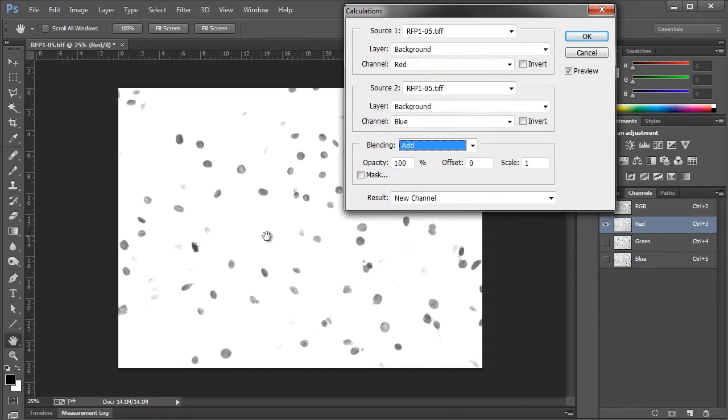And so you can see any of this white area, the pixels have a value of 1 or greater, and anywhere it's black, it's 0 or less than 0, and anything gray is in between. So yes, we're basically trying to isolate out these darker nuclei.